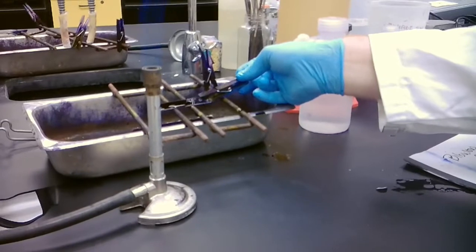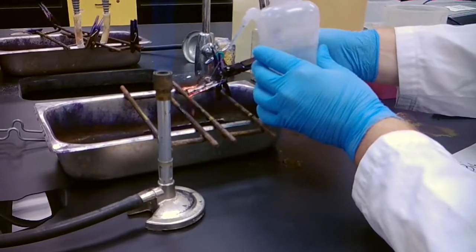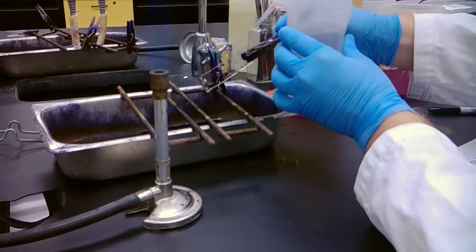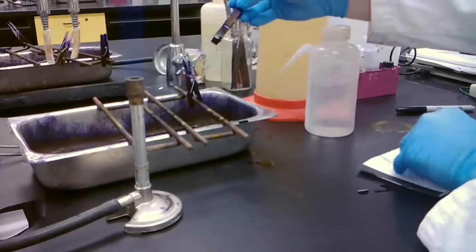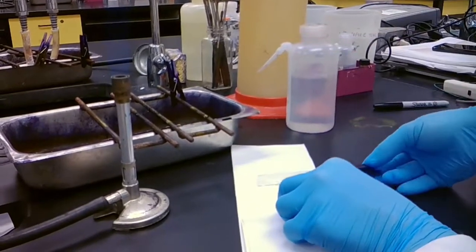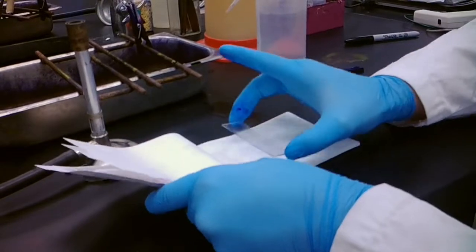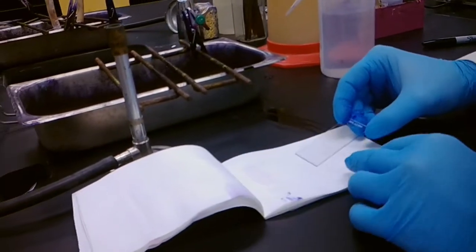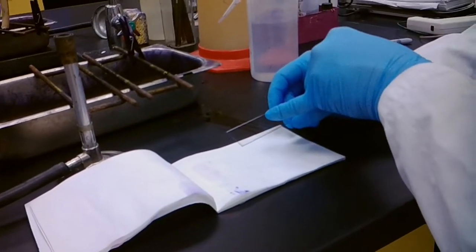Now, after about 30 seconds to a minute, we're going to rinse off any remaining stain. I'm making sure to rinse off both sides just to make sure that everything's clear when we finally go to image this. Now that everything's rinsed off, I'm going to place my slide onto my blot paper. I'm going to press down firmly, then move it over a little bit. As you can see, we have most of our dye removed, and we can still tell where we had our original smear, just barely.